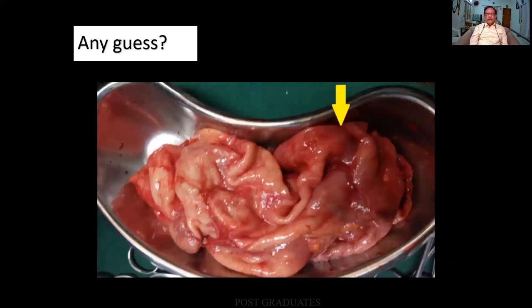What is it we are seeing? It has just been removed from the theater and it is over here. Imagine what will happen if the surgery was done on Friday and the theater staff has not sent it to us by Friday itself, left it for Saturday and Sunday, and on Monday it comes to us in a bucket. Obviously, total autolysis. Anyway, by the way, what specimen is it? It is supposed to be a collapsed but newly operated surgical specimen of the kidney, which has got a hydronephrosis.